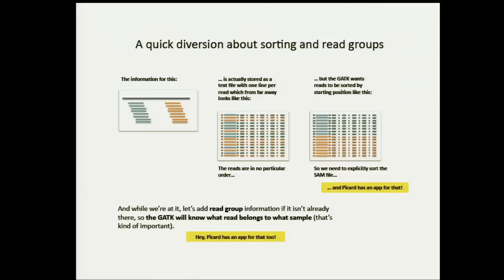So for sequencing platform performance measures, the higher the duplication rate, the worse it is, right? Now your second question, if you can repeat, I forgot. Why would you keep duplicates? Why would I keep duplicates?